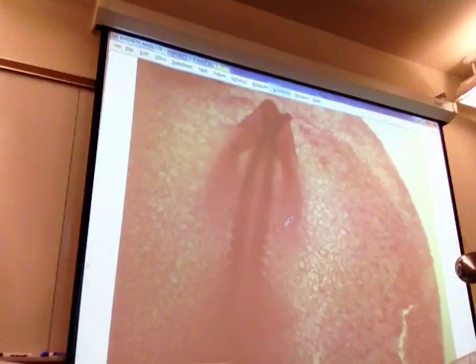Basically, if you've got a head fold and a tail fold, you're past the primitive streak time. Well, you don't see any of that. All you see is a groove going down the middle. In both of the ones that we looked at, we have a definite head on this embryo, so that's past primitive streak time. But if you've got a flat disc, and all you've got is a streak down the middle, yeah, that's the primitive streak. Okay, and I think that's what you see in the 12-hour.